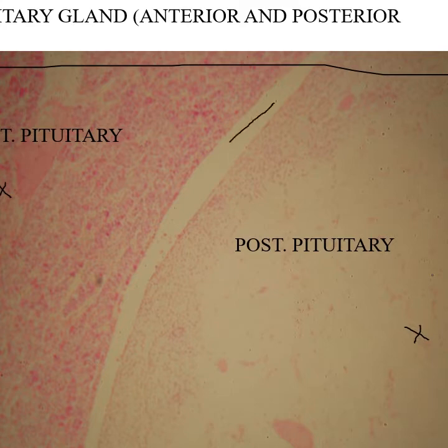This crack here is an artifact that won't be present in all of the slides, but it's actually present in many. And what you'll notice over here on your right, the posterior pituitary, because it's made of basically a bunch of axons and a few glial cells, it does not stain very well. I mean, this thing is almost always very light. You know, the few dots you see here are glial cells. There are no nuclei of the neurons over here. They're up in the hypothalamus. And nervous tissue does not stain very well with our standard eosin hematoxylin stain. So it's almost always going to be lighter.